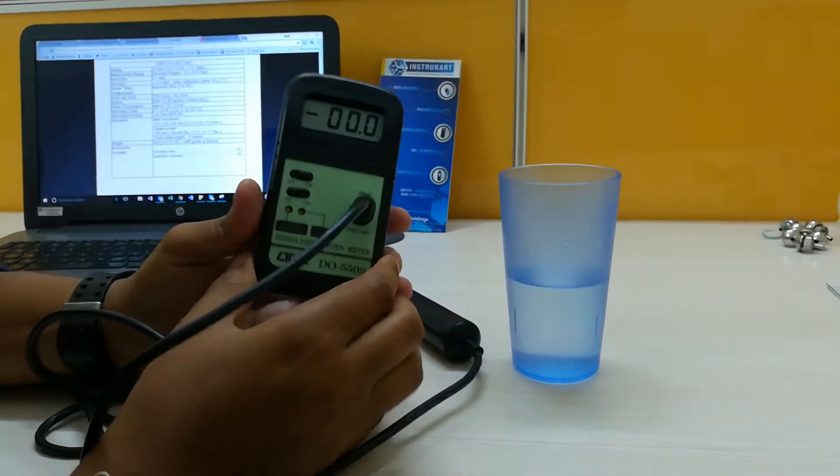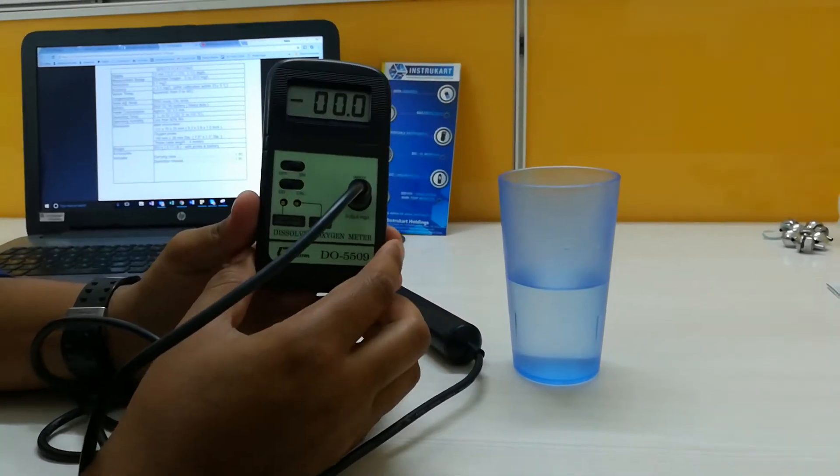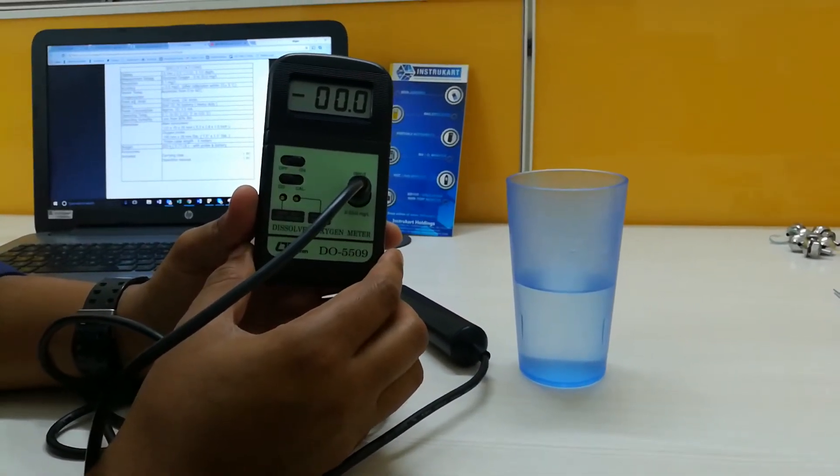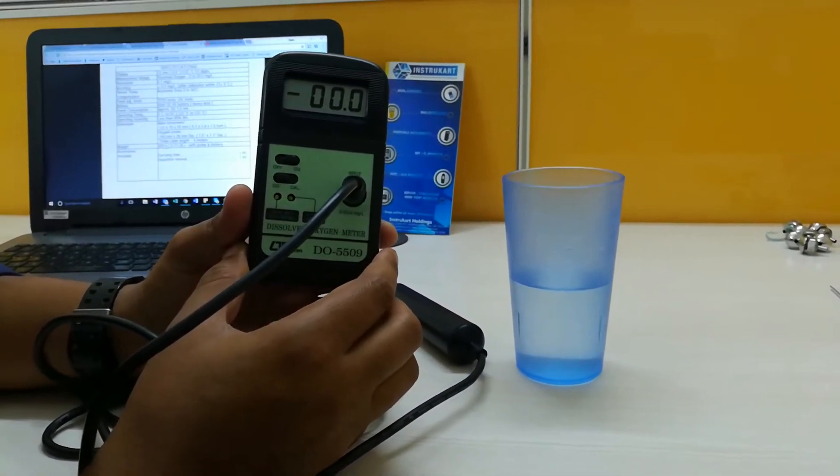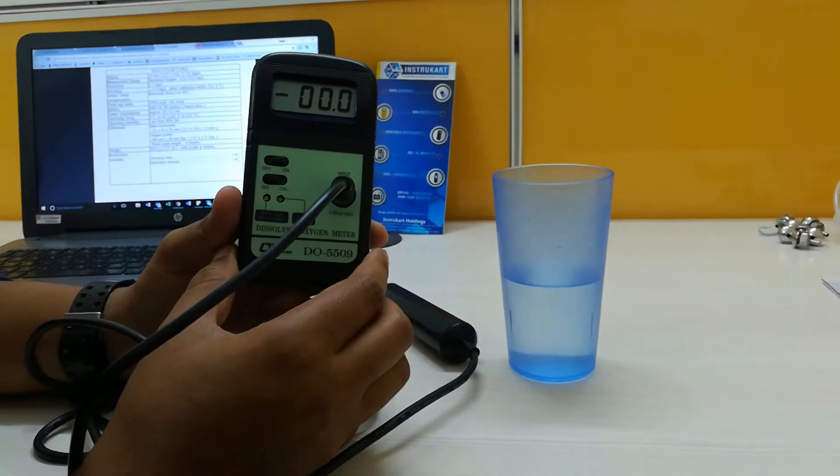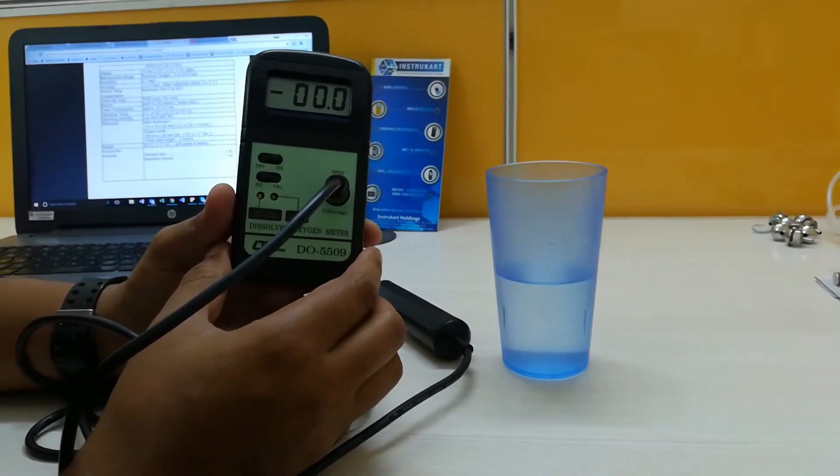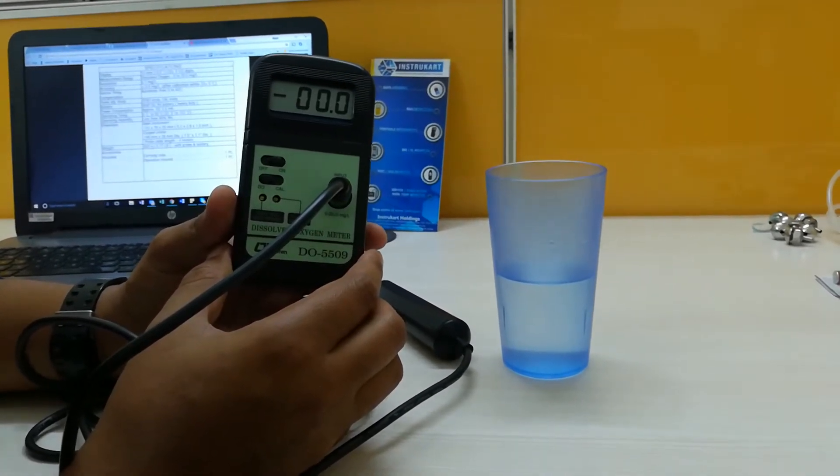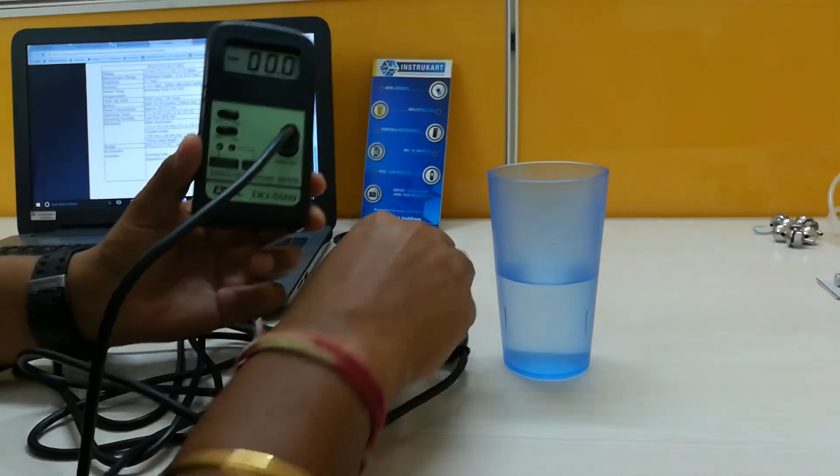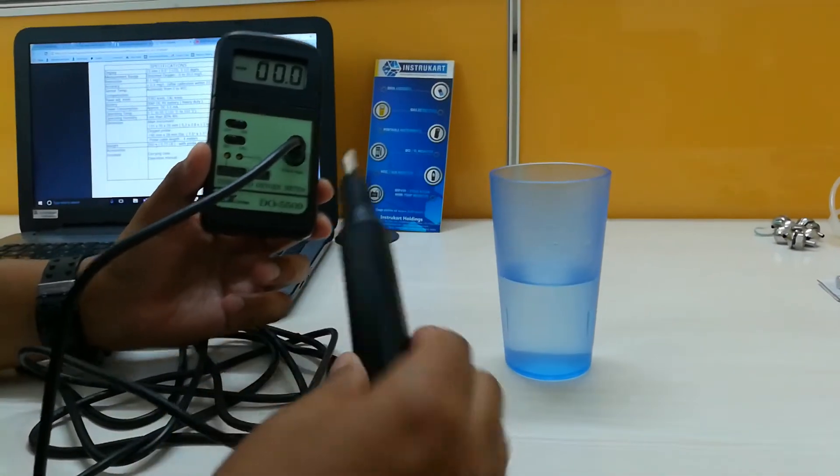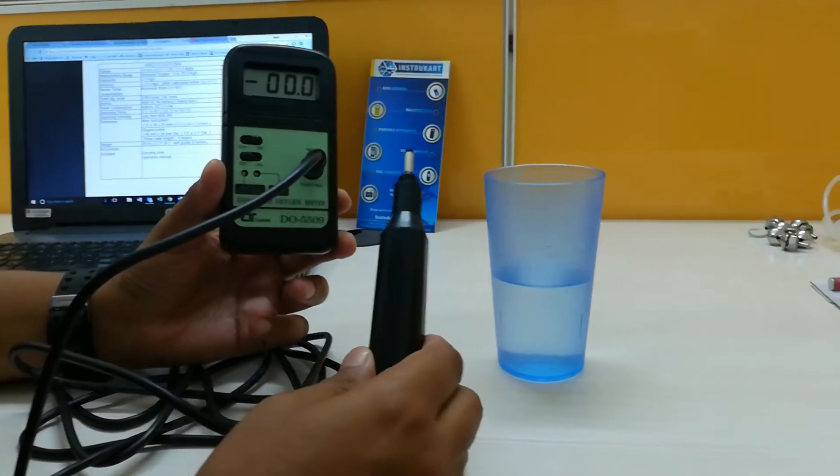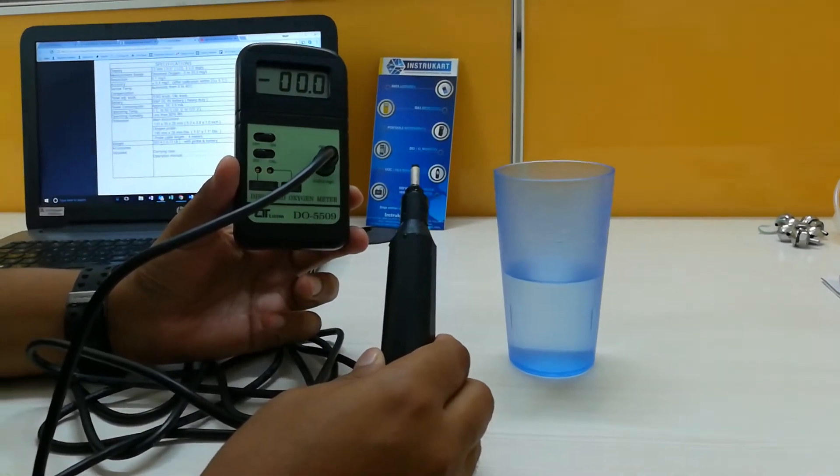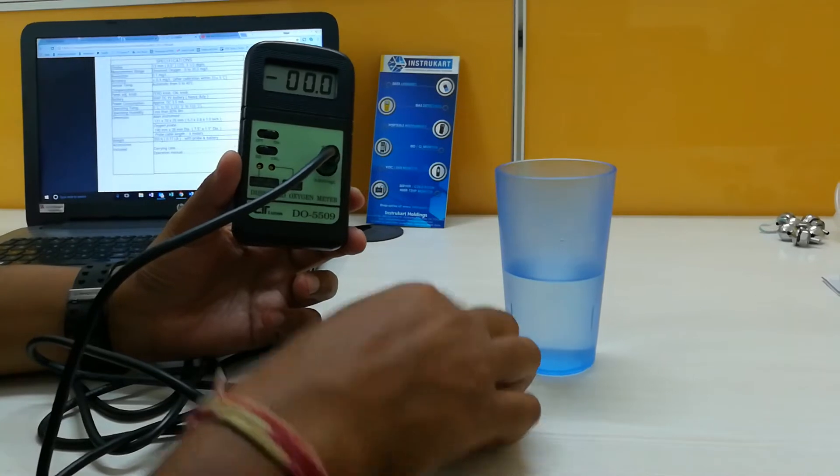We can use this instrument in aquaculture, ponds, and wherever you want to see the dissolved oxygen content in water. This comes with a probe and a display.